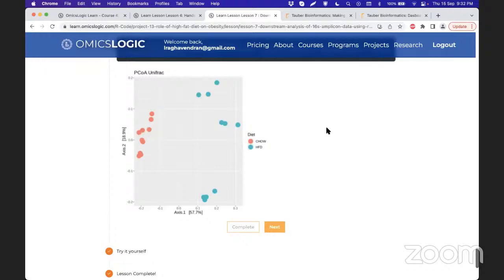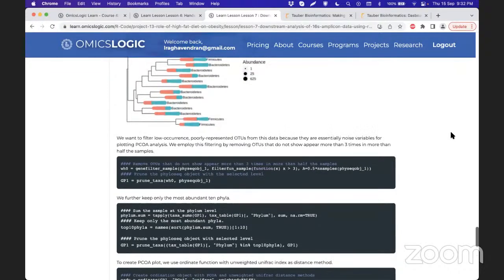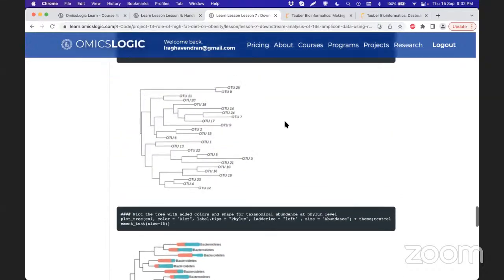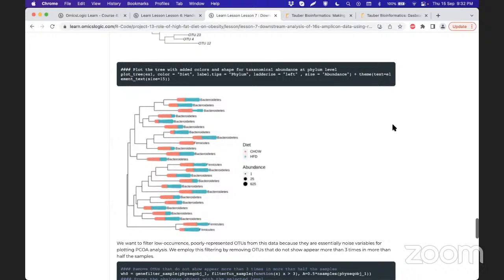It also gives you a lot of freedom in terms of grouping of samples according to phyla, kingdom, and so on. Or you can restrict your analysis to the top 25 OTUs or top 50, depending upon their abundance levels or diversity levels. That can also be studied.